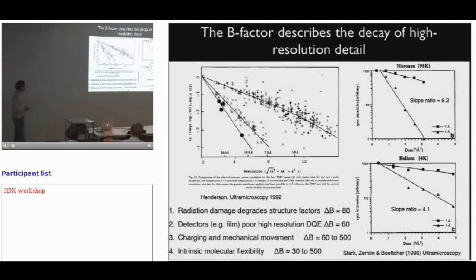And there are several reasons for this, pretty much summarized here, and there are probably other contributing factors as well. Of course, this kind of decay of amplitudes can then be described quantitatively, and you want to take care of this if you're looking at collecting image data at that resolution in order to compensate for this. One major contribution is, I guess, the radiation damage that you introduce by depositing the dose on the specimen.